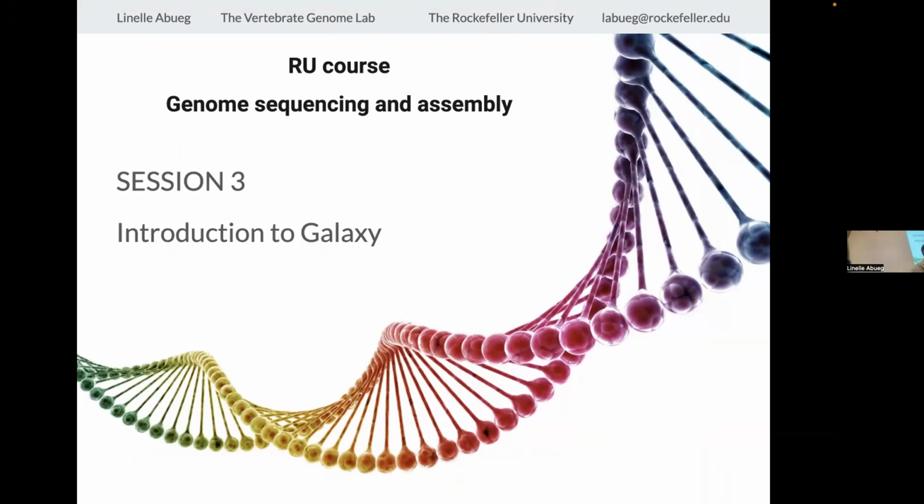The coverage depends both on how many molecules you get between the barbells, but then also how many times you go around the circle. Yes. I will go into that later with HiFi and the difference between what they call the continuous long read, CLR, and HiFi. For the CLR, you can get 40, 50 kb, very low quality.